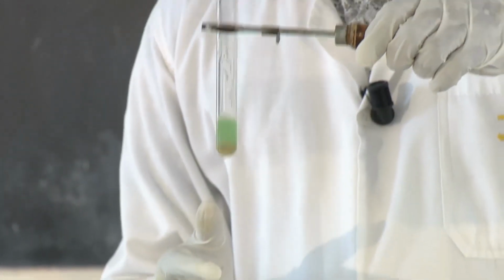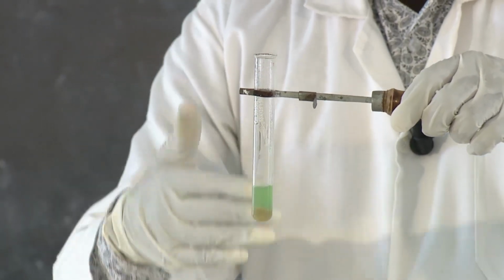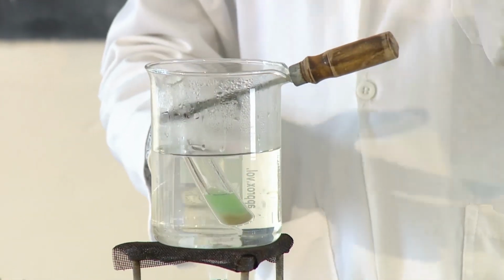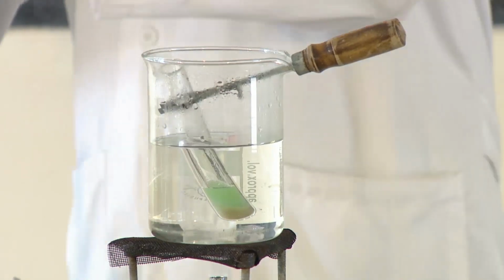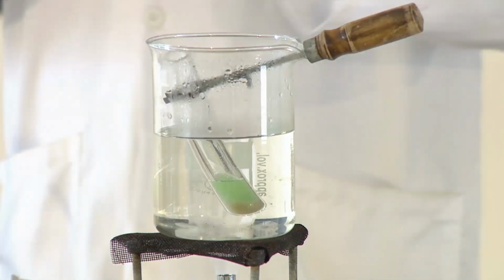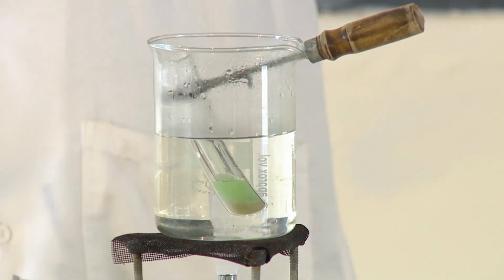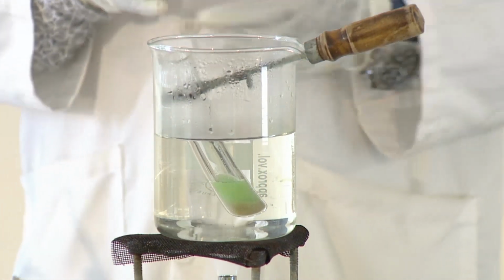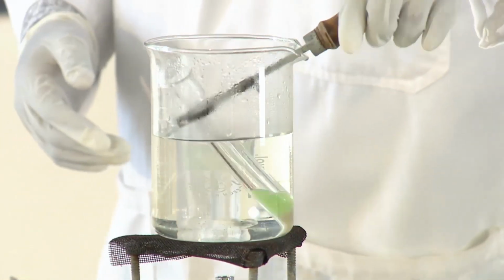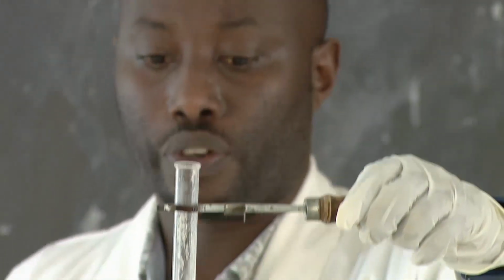As you see, the color which was blue is trying to change from blue to green. So it is changing from blue to green, then from green to yellow, and finally to moderate orange or orange precipitate. You can have orange precipitate, or moderate orange precipitate, or what you call brick red. As you are seeing, it is changing to green. We are observing it is changing from blue to green.